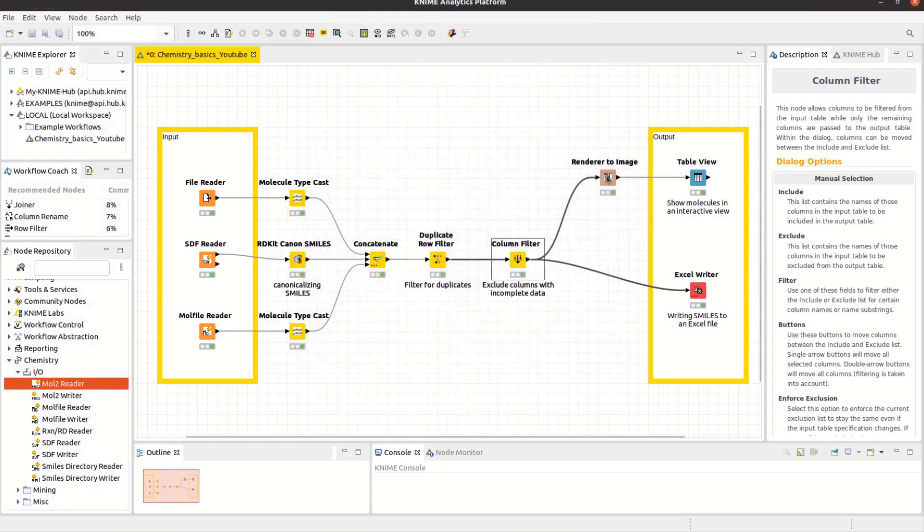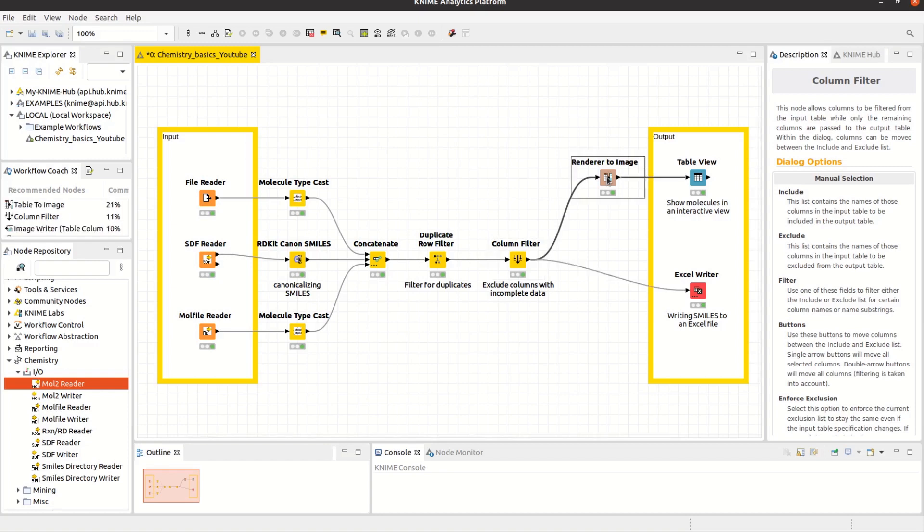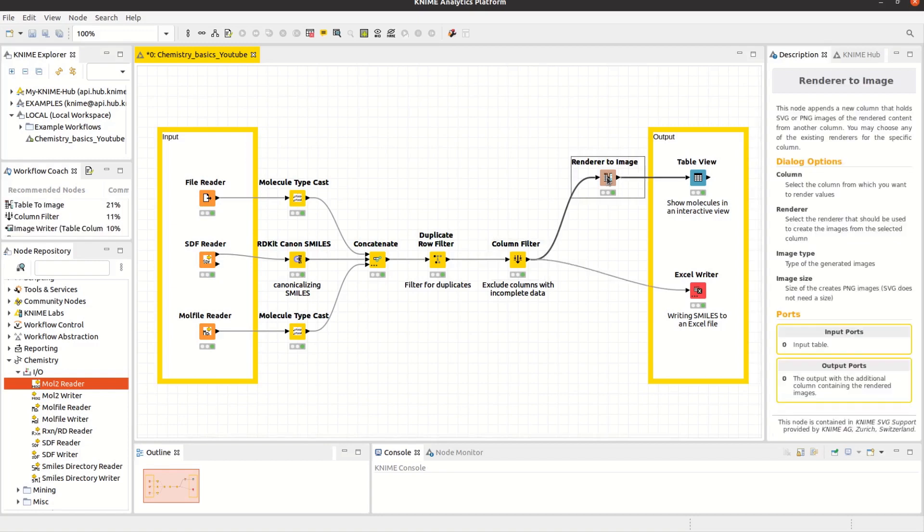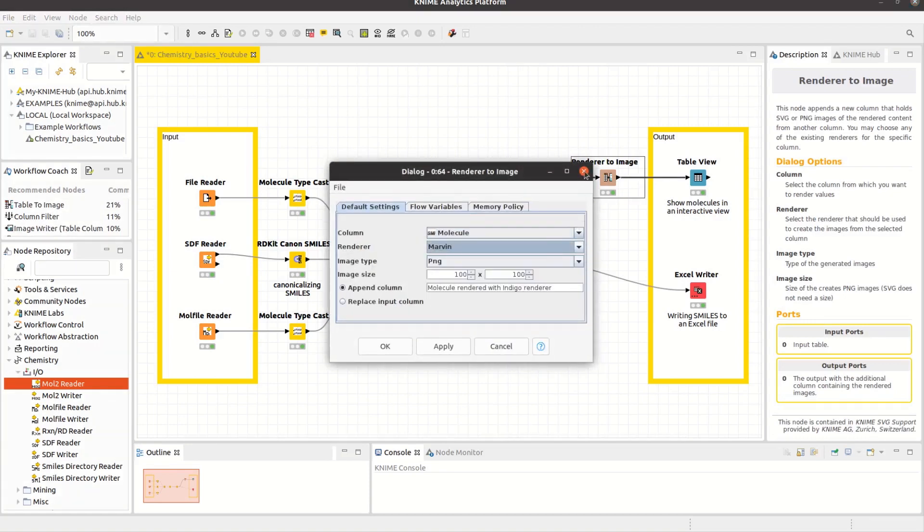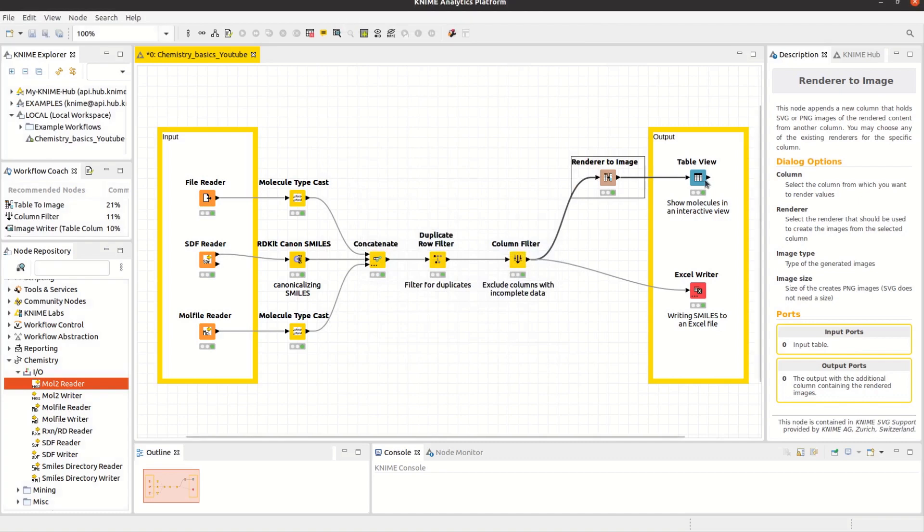If you have installed any Cheminformatics extension containing a renderer, you can use a renderer to image node. Select the molecule column and the according renderer. With the resulting images, you can easily create an interactive view.